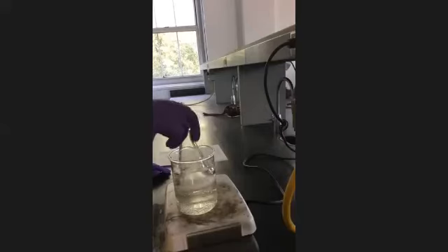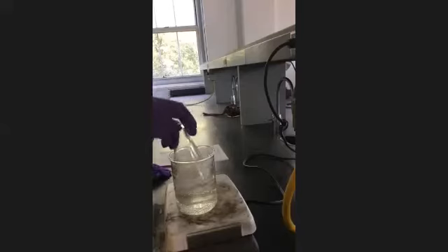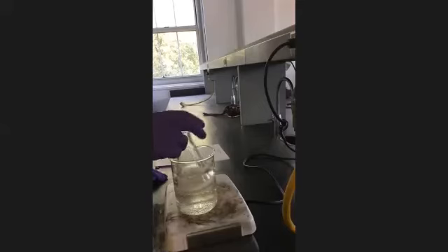It just started to go in solution here. It's still solid. That water is just not hot enough. That's all right, we got a fix for it. It's going in. You want to swirl it until it's all the way in. Once it's clear, you want to keep it on the heat for another 5 minutes.